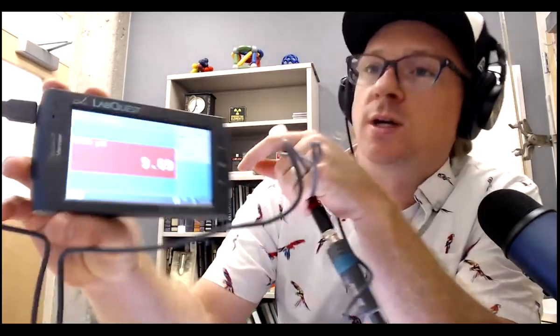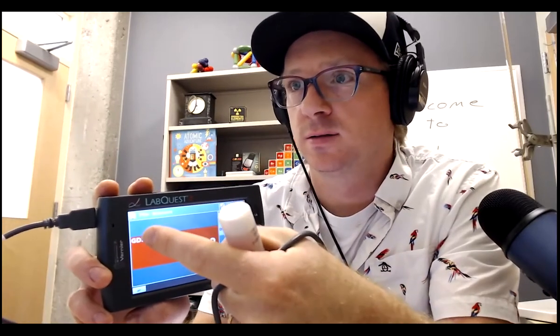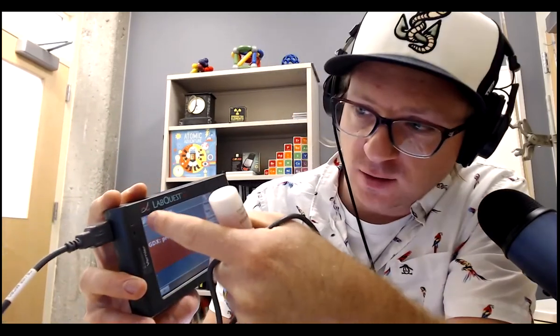You're going to have to switch the mode. So there's three screens up here that are going to come in handy. Starting over on the first one, way over here on the left, it's the main page. It's the meter page. You could click on this. You might have to calibrate. We're not going to do that. You might have to set it up. That happens with other sensors.